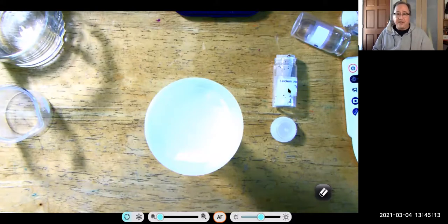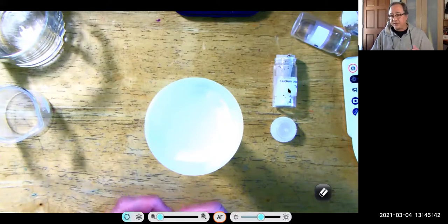And when you rinse again, you do still have soapy water left over, but it's not very soapy at all, because the amount of water you add to rinse compared to the amount of soapy water left behind is much greater. So when you rinse again, you probably have 1/100th of the amount of soap in your clothes afterwards. And for people that are really sensitive to soap, you might even rinse again. If you rinse again, instead of 1/100th, you'll end up having like 1/10,000th of the amount of soap in your clothes after you rinse a second time.